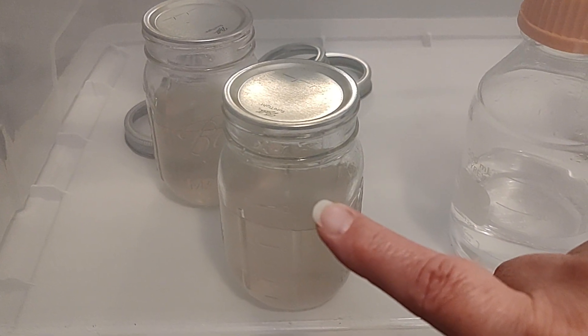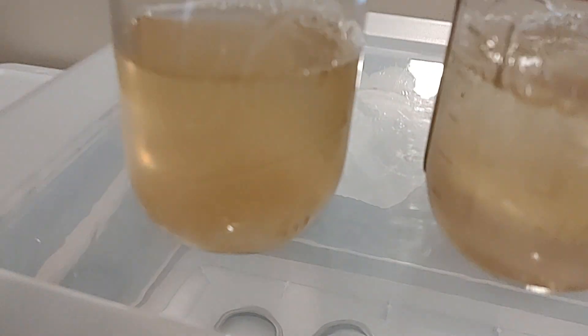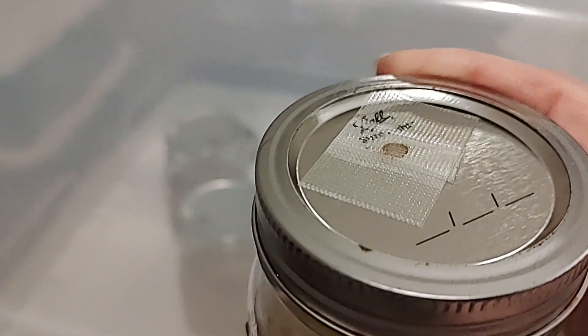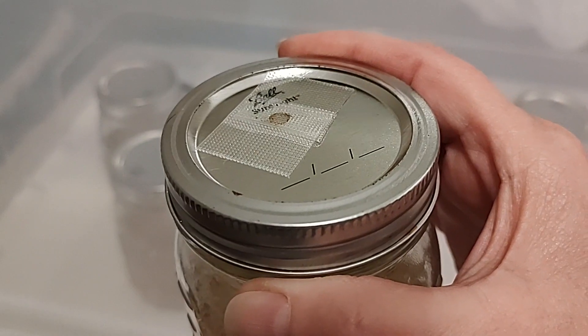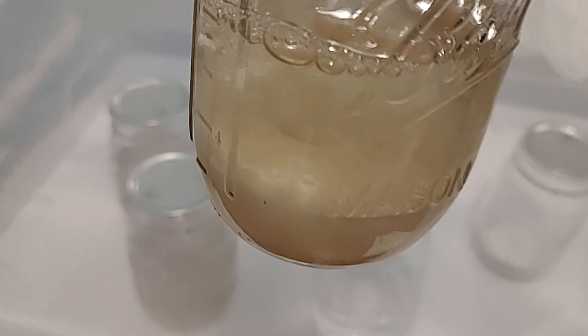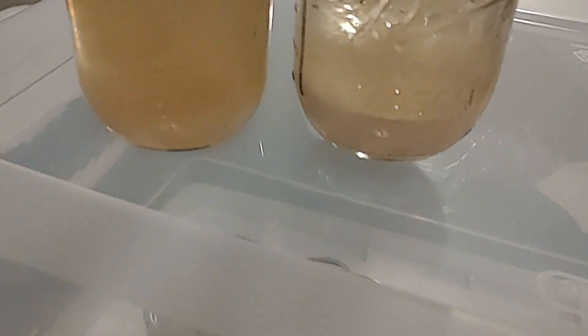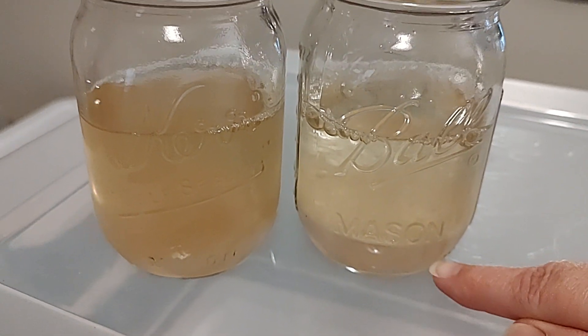The liquid cultures have longevity, a long life. What we've discovered is that when you mod these tops and there's air exchange, they last even longer. This is breathable tape that we have here. We've corrected our issue with the slurry and just made a thinner agar at the bottom.